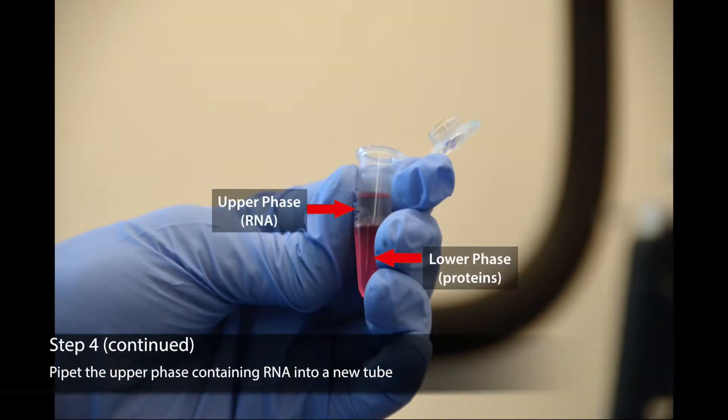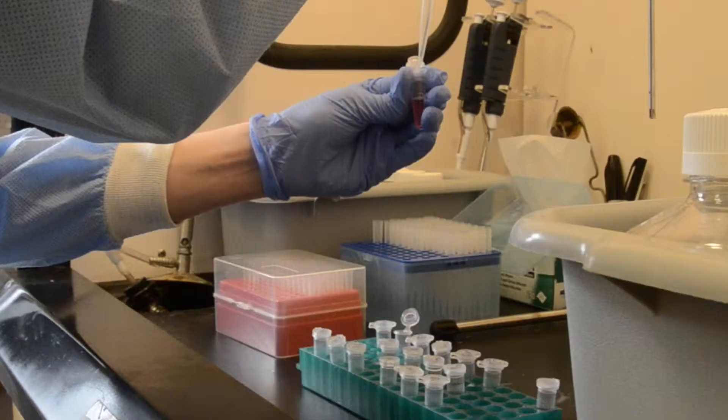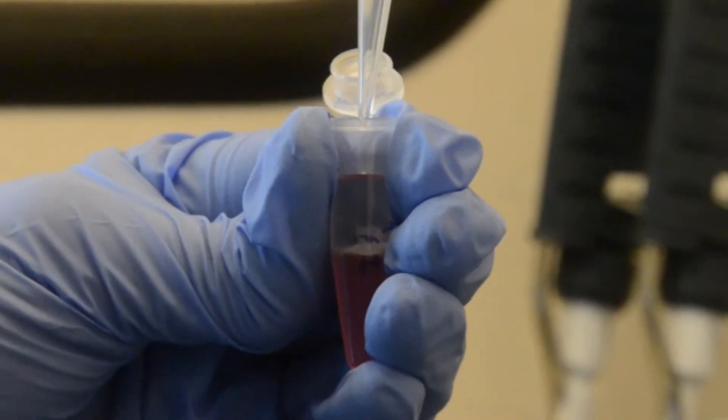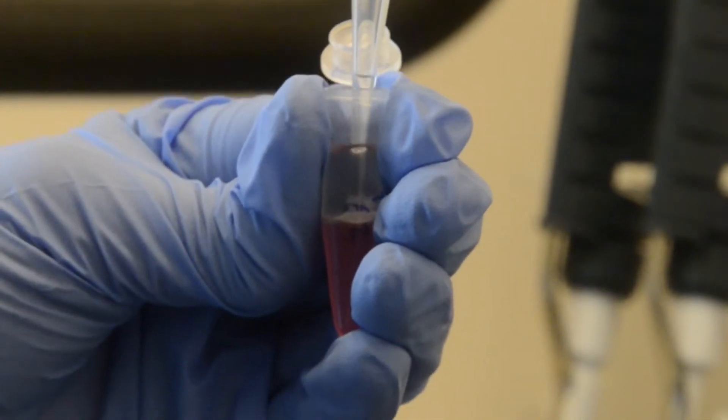After centrifuging, pipette the upper phase into a new tube. Record the exact amount pipetted. The amount you pipette will equal one volume. Avoid puncturing the hazy middle layer and touching any of the phenol layer, both of which will result in an unsuccessful extraction.